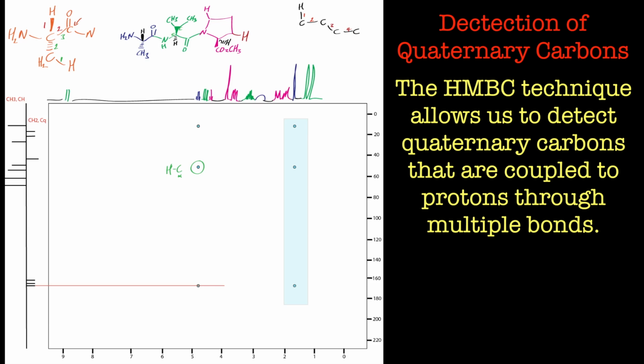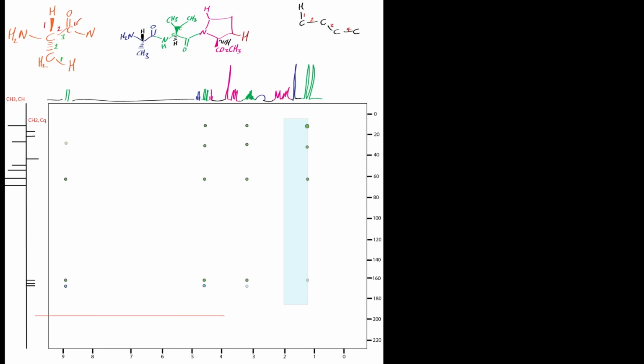So that's alanine. So let's just tidy this up, but I'll try and leave that box there actually, because it might come in useful. And I'll keep that line as well actually. Okay, so that's alanine, and we've identified each carbon on the alanine from that. Let's move on to the next part of the spectrum, which is valine. Now valine is a little bit more complex because there's more carbons present.